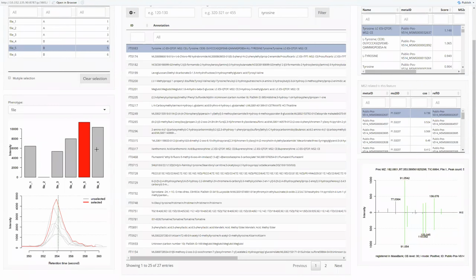The next is file 6, the next highest chromatogram, and file 4, the next highest, and then file 1, and then file 3. By doing this, you can evaluate how likely your intensity call is right or wrong. I think in this case, it's rather good.